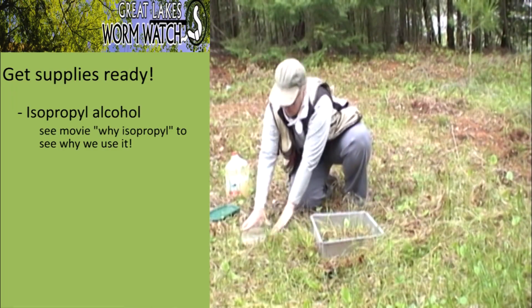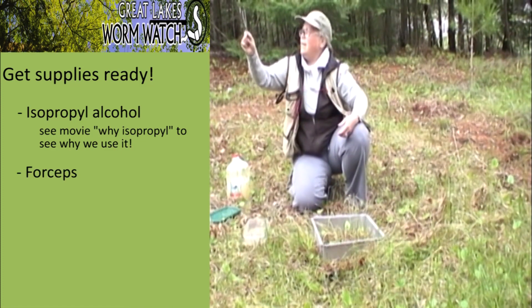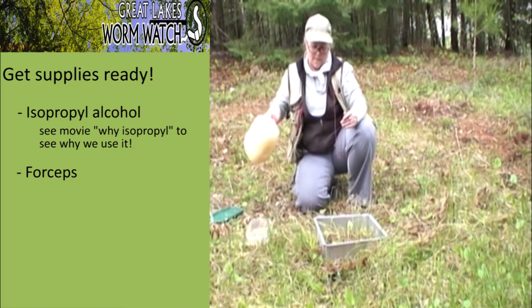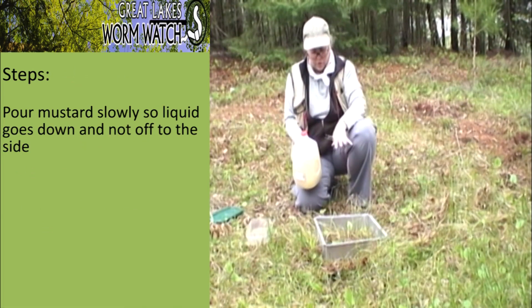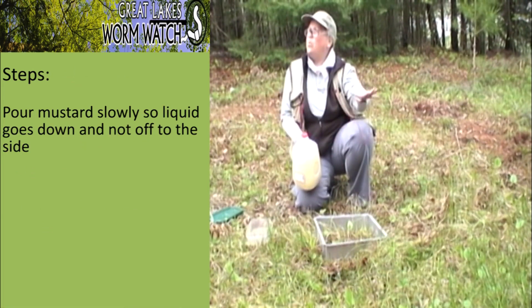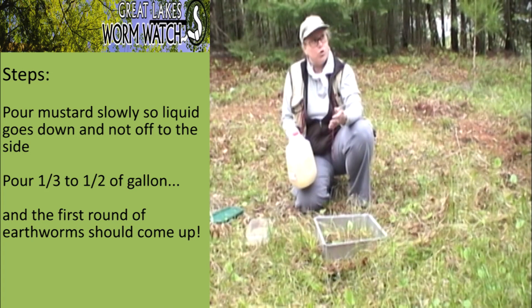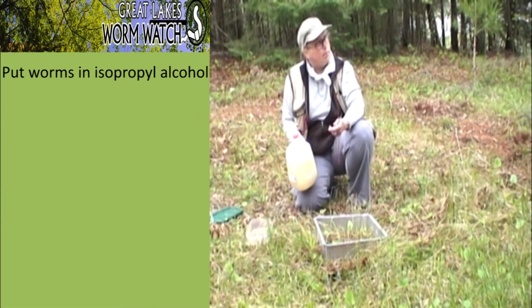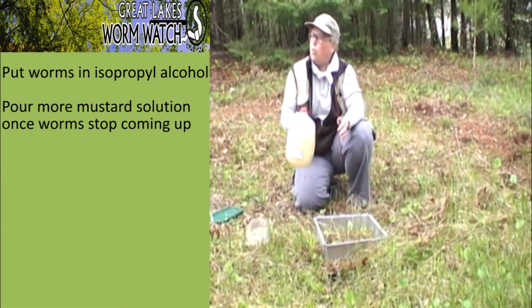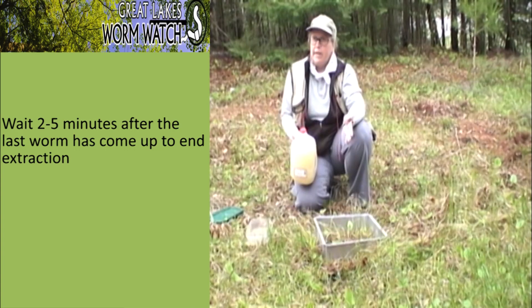I have isopropyl alcohol here and my forceps tied to me so I can't lose them. I do one last shake of my mustard solution. The way this is going to work: I'm going to pour it slowly so it percolates down rather than runs off. I'll pour maybe a third to a half of the gallon. By then, earthworms should be coming up if they're present, and I'll pick them and put them in the alcohol until they stop coming up. Then I'll do another pour, two or three pours, until the whole gallon is gone.